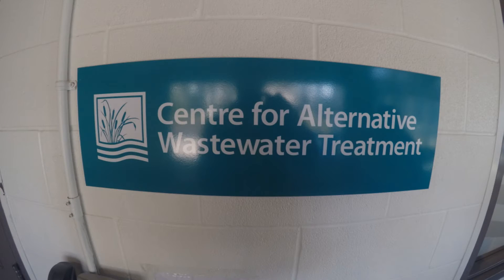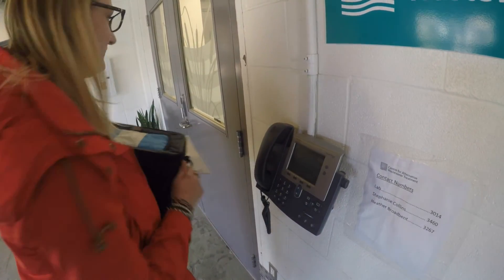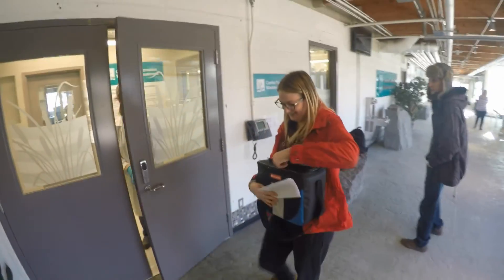Deliver the samples to either the CAWT lab located at Fleming College in Lindsay or the SGS lab located in Lakefield. Please choose the closest lab to the lake that you are sampling. The results will be sent to you and will be presented in number of E. coli colony forming units per 100 milliliters.